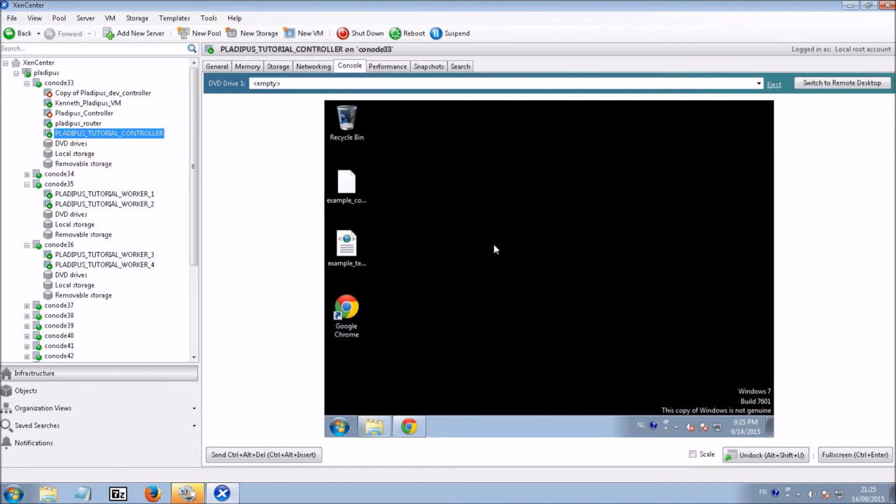Hello and welcome to the Pladipus tutorial video, in which I will show you how to set up Pladipus, and I will also demonstrate a distributed sequence database search using this setup.